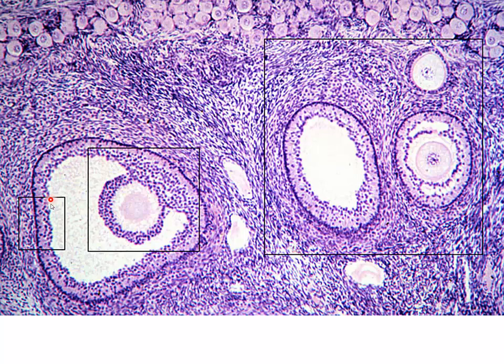Here, I personally would go with secondary, but they're probably going to say Graafian follicle because of how large this unit is. But here we have the oocyte, we have our corona radiata cells, cumulus oophorus covering the corona radiata and creating the bridge back to the granulosa cells. Personally, since there's still such a big attachment, I will go with secondary follicle for this one.